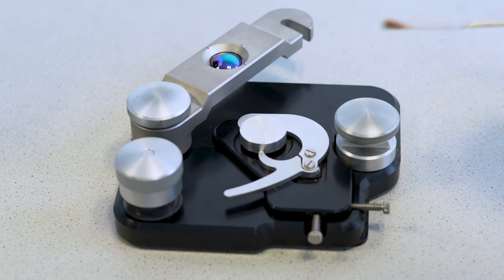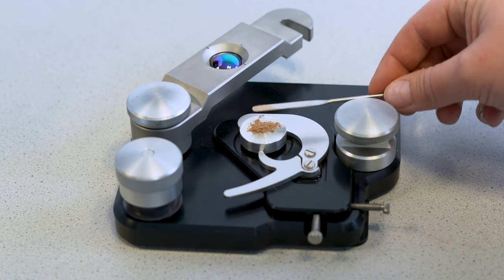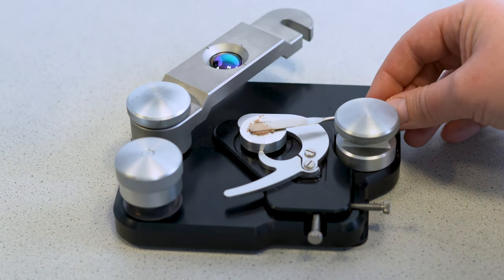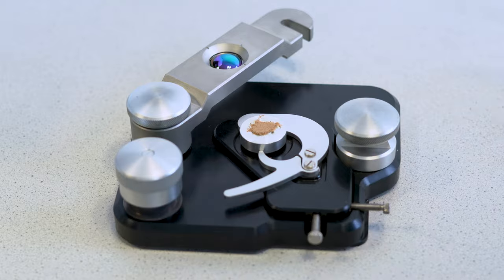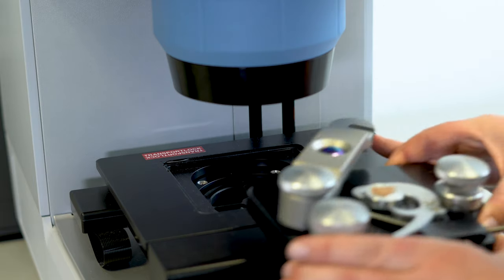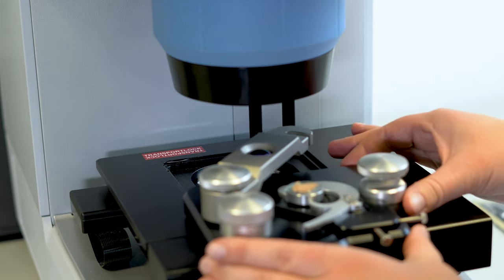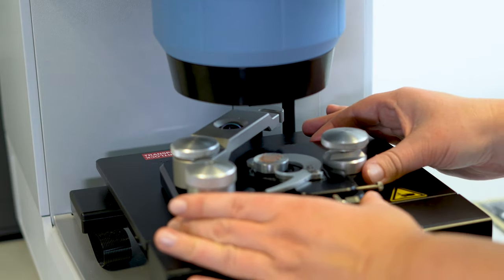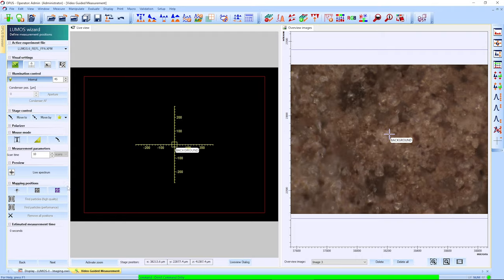For the analysis, we place the powder onto the accessory, press it down and slide the whole thing under the Lumos 2. Let's start the analysis.